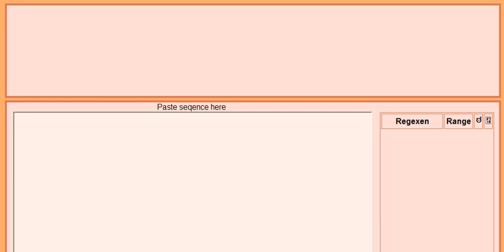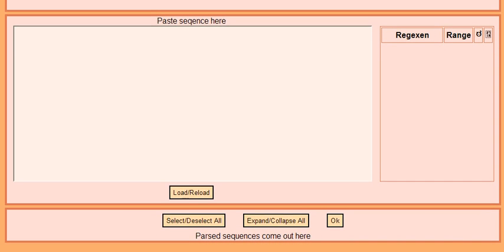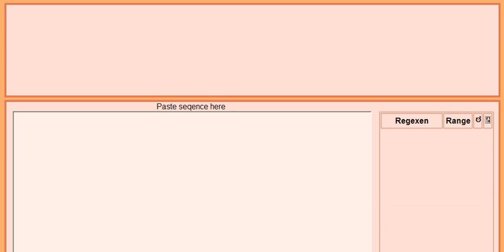The user interface elements of Yantra are labeled as shown. The workflow is a combination of certain user interface manipulations. An example will be demonstrated now.